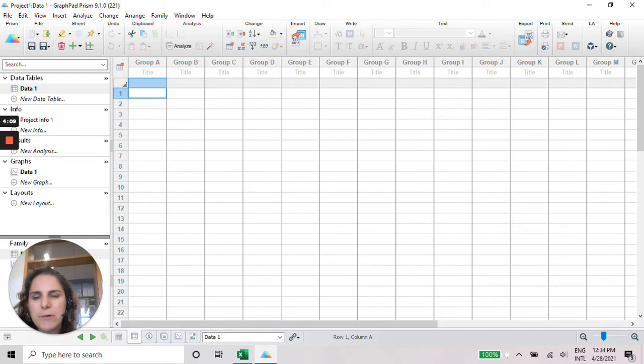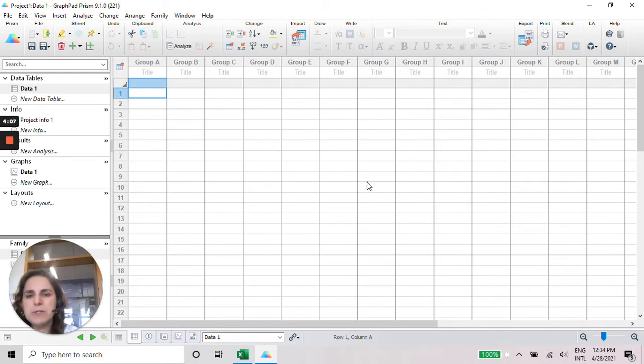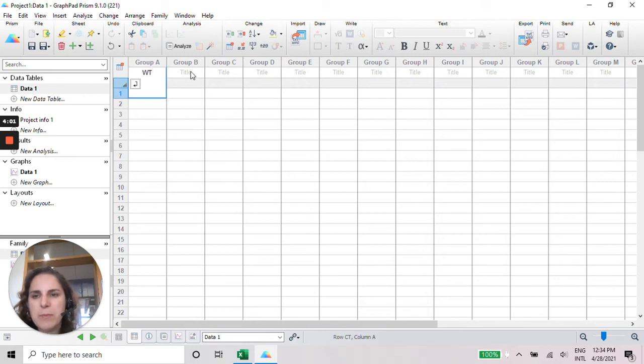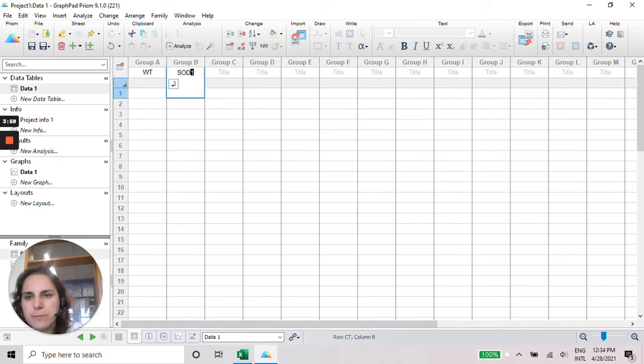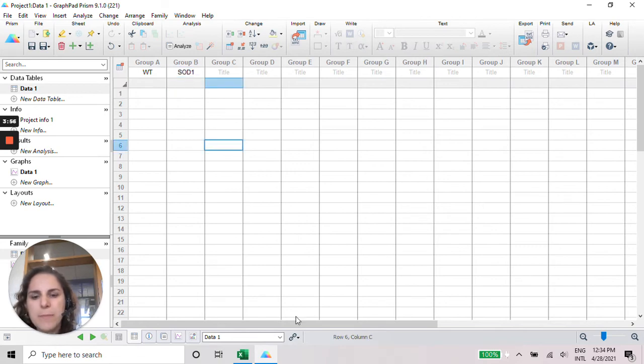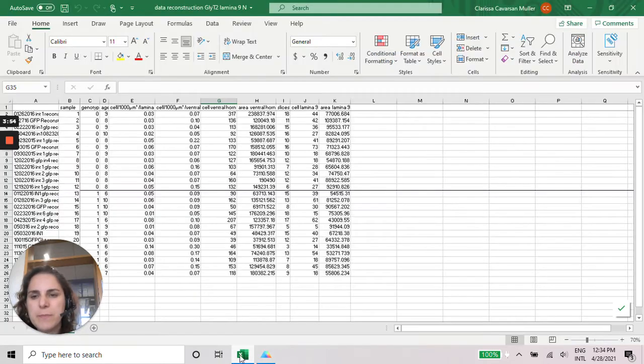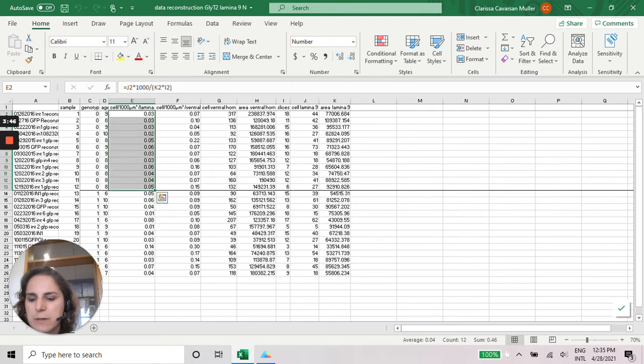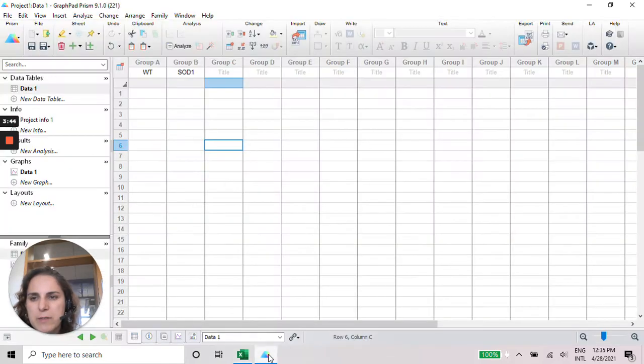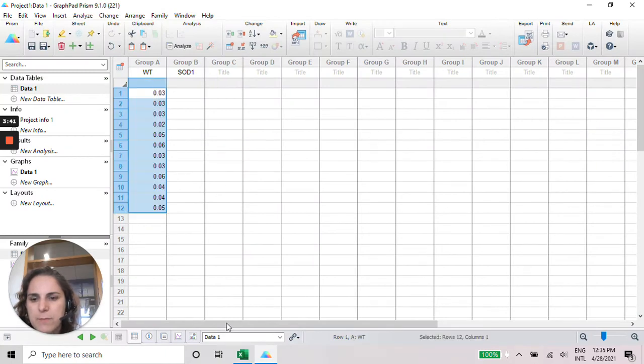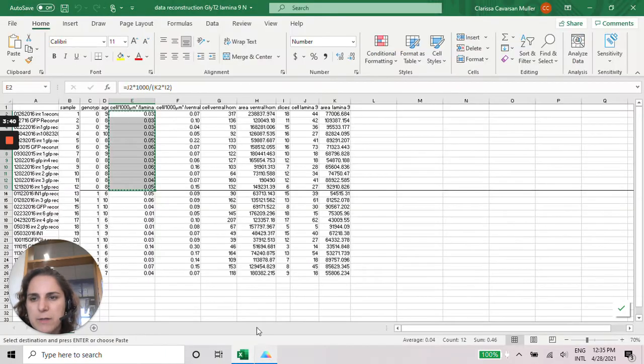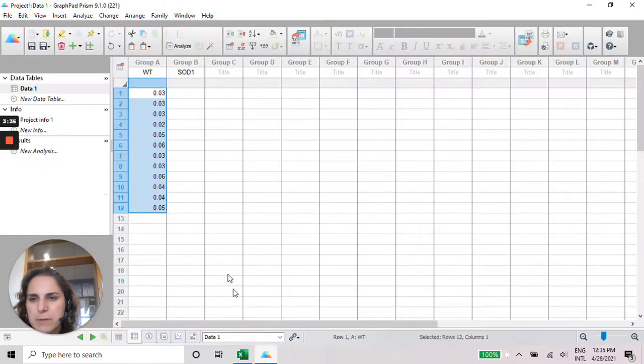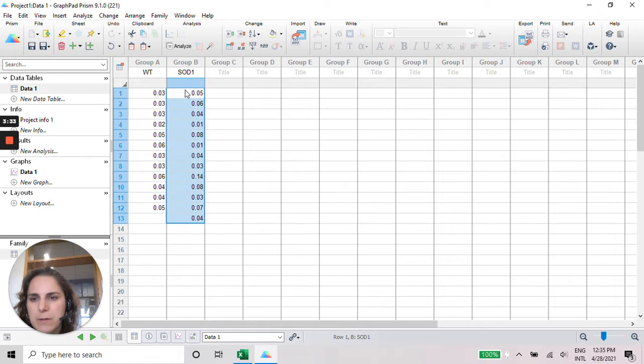When you click on Create, it's going to open this spreadsheet blank that you need to fill up with your data. So we are going to have a wild type animal and our transgenic animal. And here is going to be our data. Just copy and paste there. For wild type and transgenic animals. Okay.